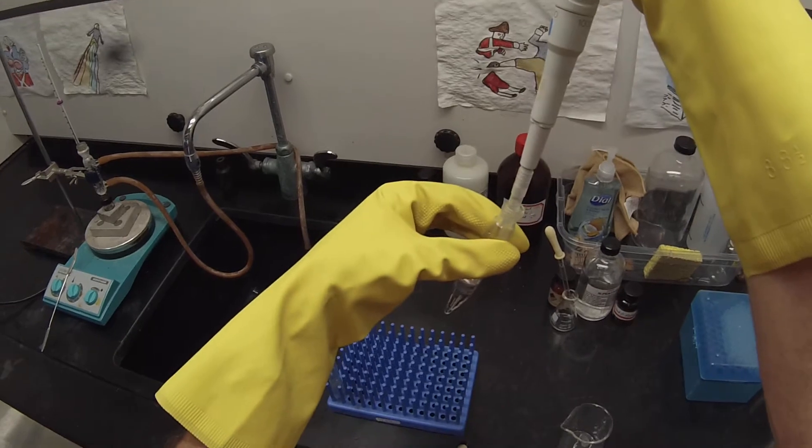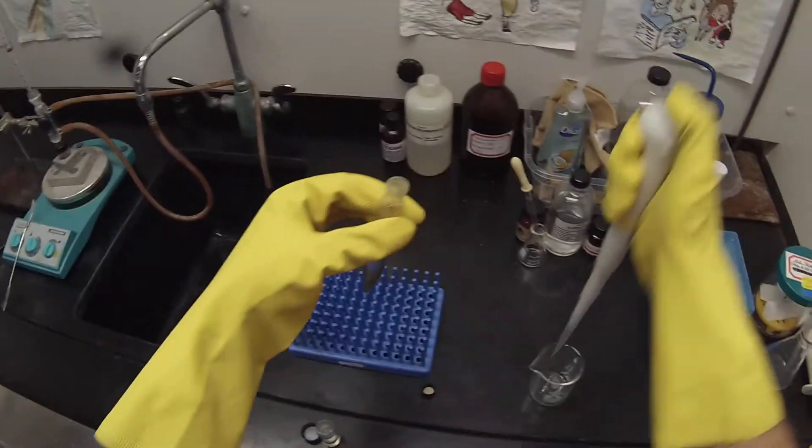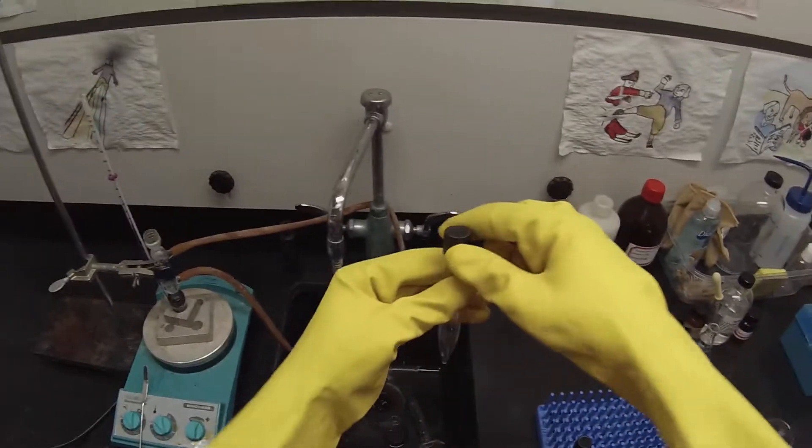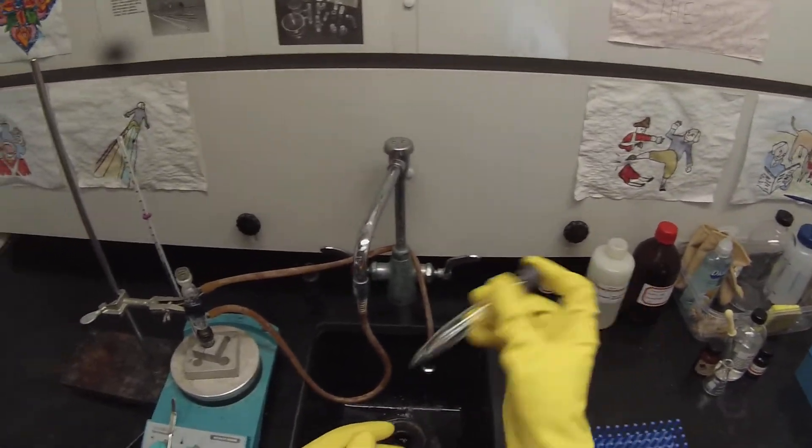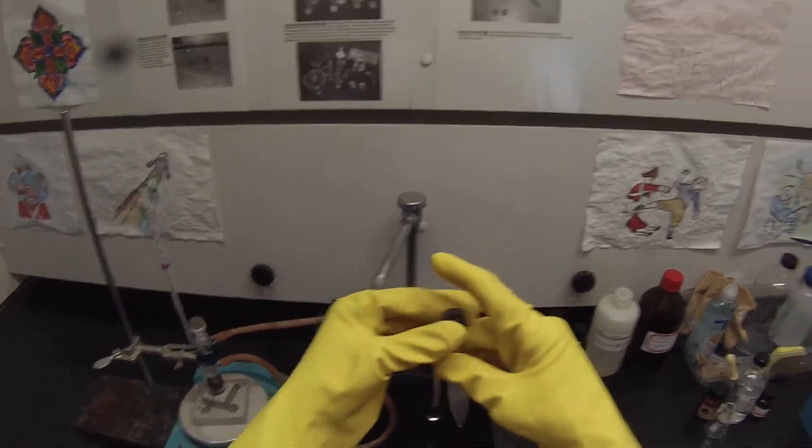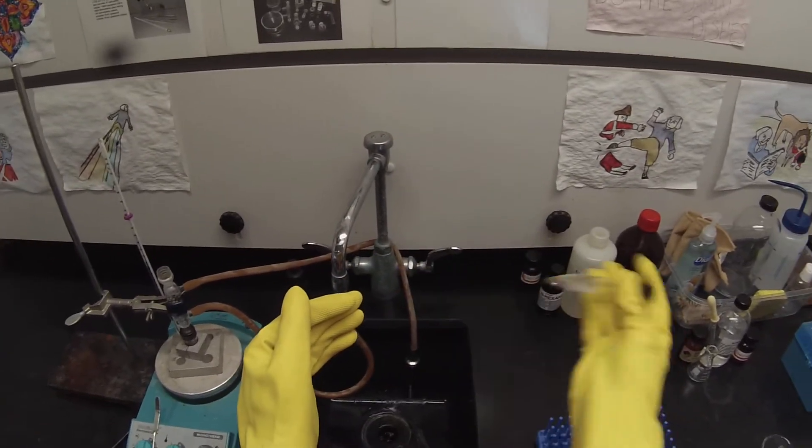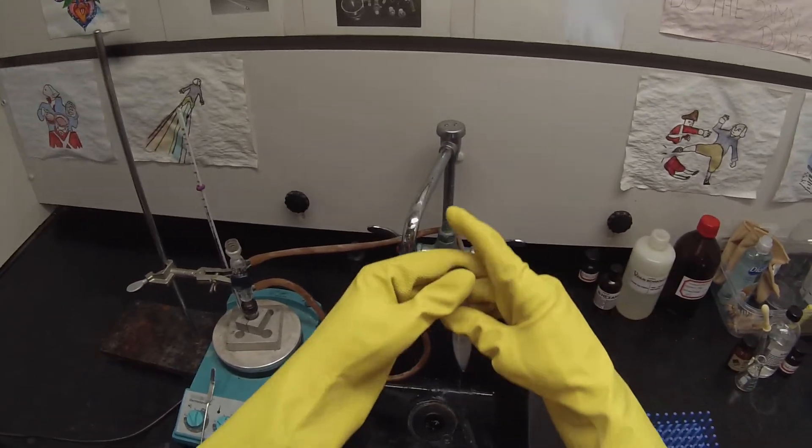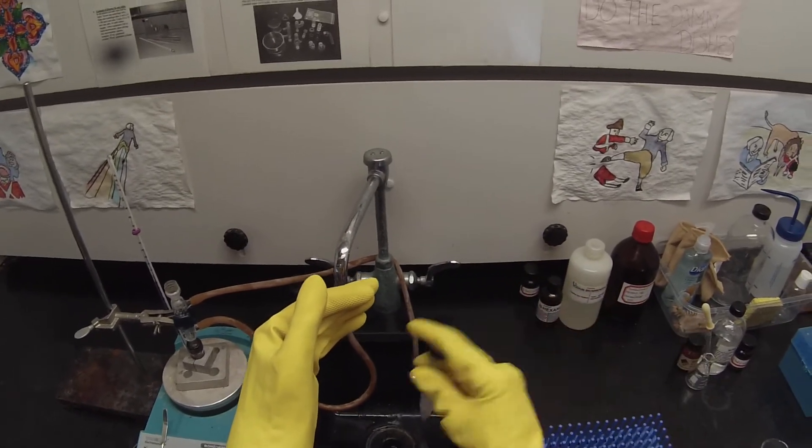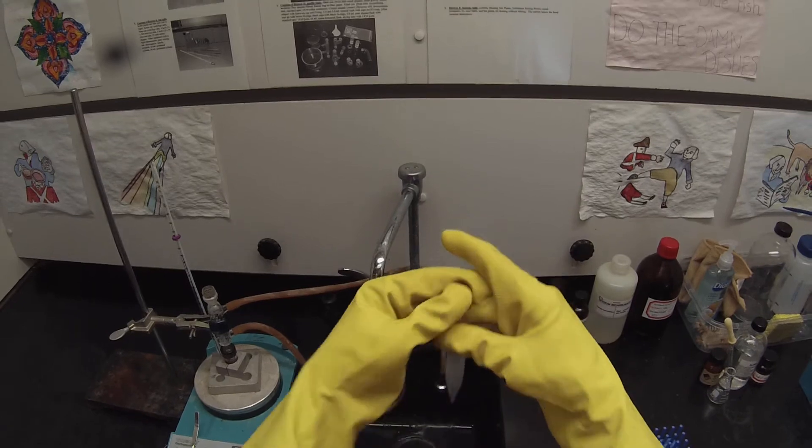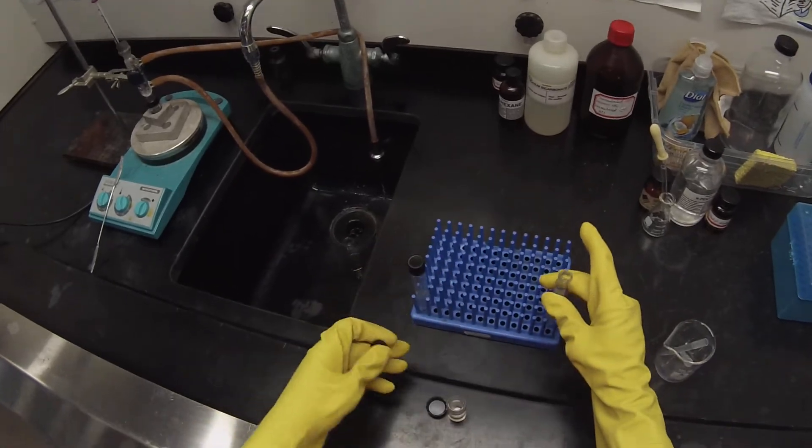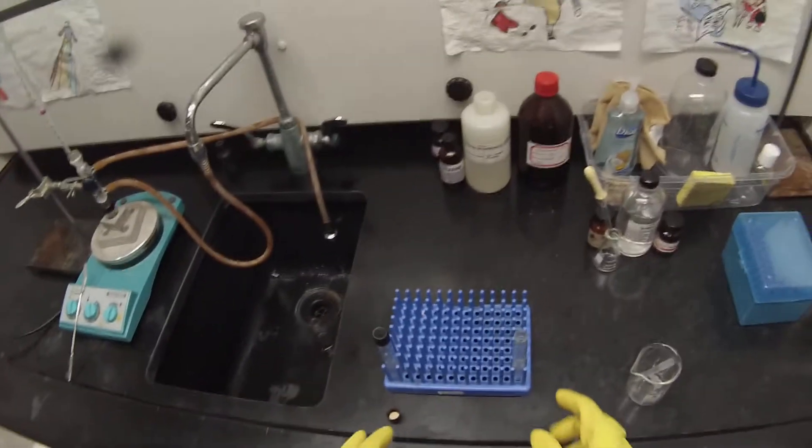So we're adding the t-butanol. Get rid of the tip. Set this guy down. And then I'm just going to shake that back and forth. Give it a little vent. Shake it back and forth. And I just want to do this for about 15 seconds. And then I'm going to let it settle. Just enough that I can pipette that top layer without getting any of the bottom layer.